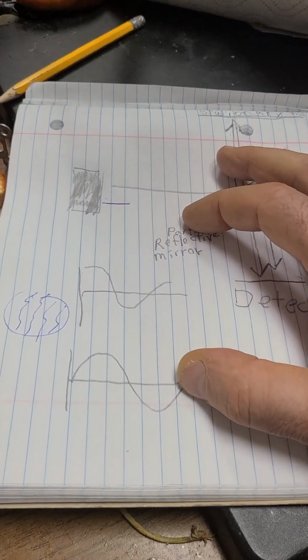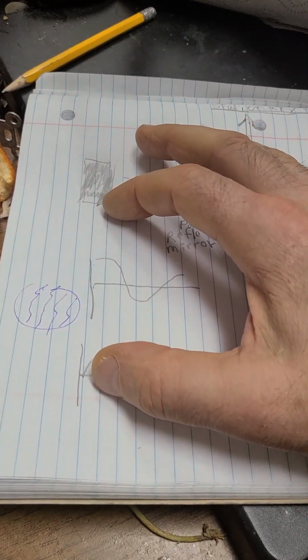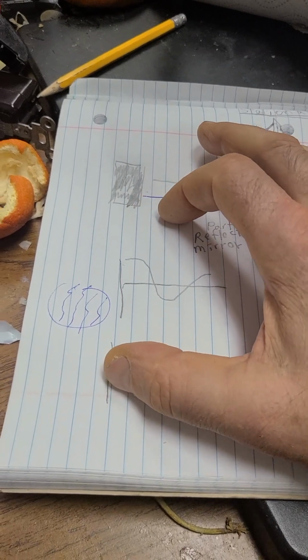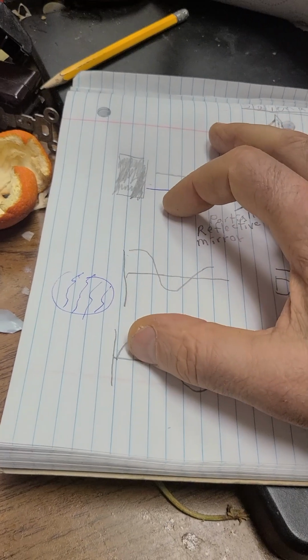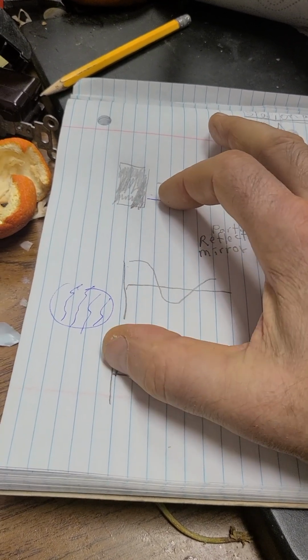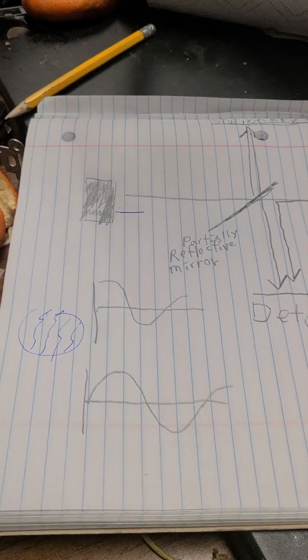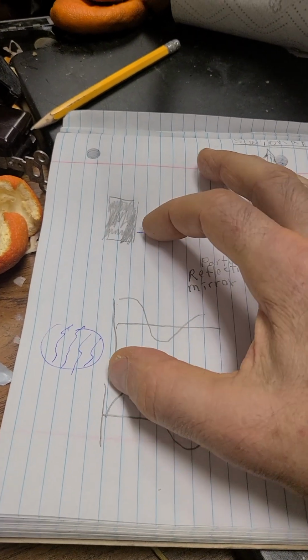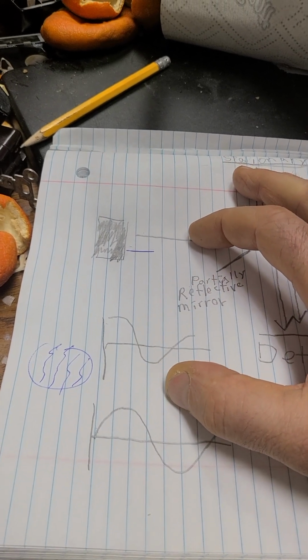So in that analysis, let's just look at one certain frequency only. Now, since they're coming from different spots, the comparative phase could differ. One could have its peak starting out at a certain time, and the other could have the peak being zero at the get-go time. But the question is how much distance do we have to move along the graph?